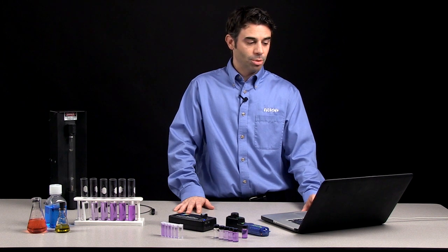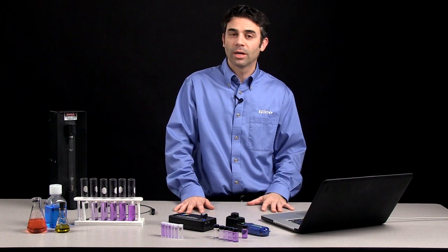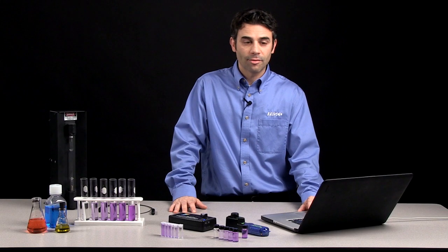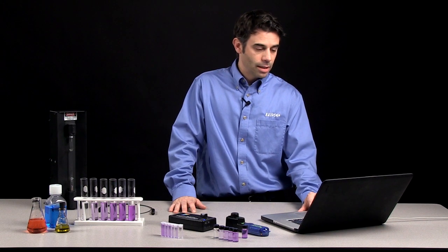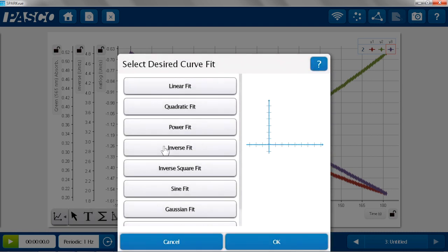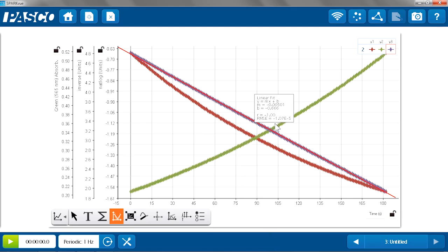And then I can apply those calculations onto the graph. And in this case, I put them onto the same graph using a multi-wide feature of SparkView. So I see my green absorbance, my inverse absorbance, and my natural log of absorbance. And I definitely noticed that the natural log of absorbance is the straightest line, indicating a first-order reaction. And again, we can quantify that a little bit more using the fit tools, in this case a linear fit, on that particular set of data.